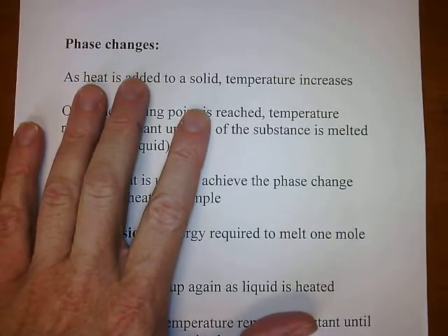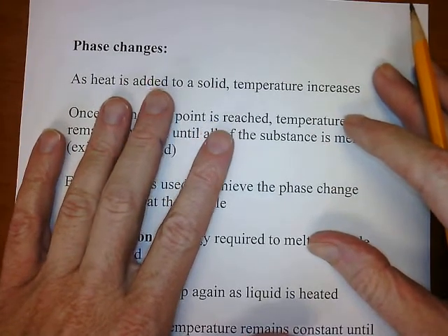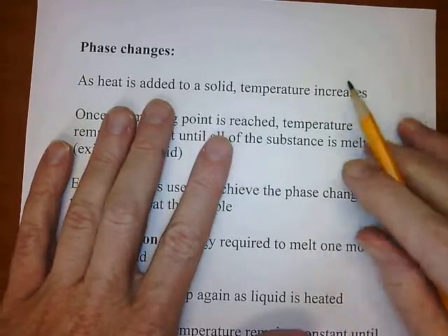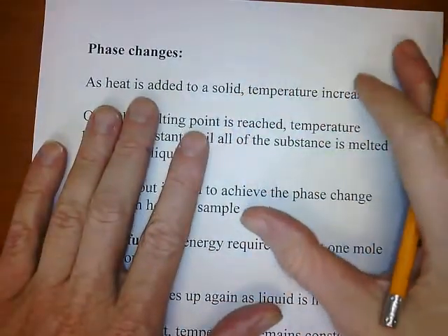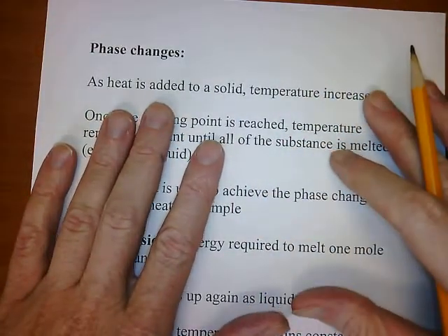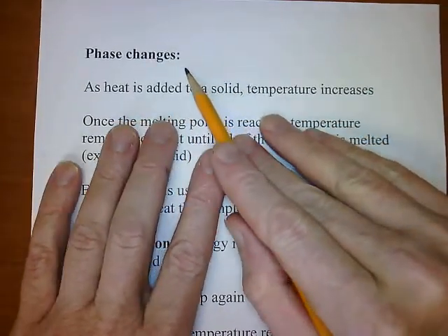This is the lab lecture for the determination of molar mass by freezing point depression. I want to go in and talk about some background material here that you might not have got to in the lecture yet. Alright, so I want to start out here by talking about phase changes.